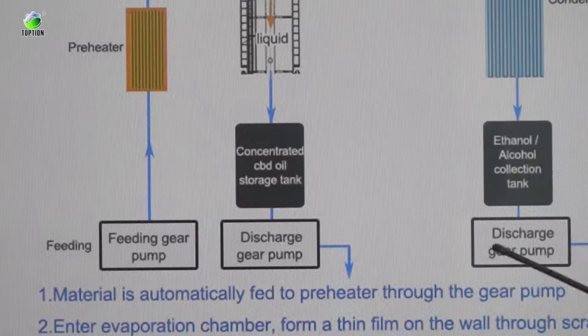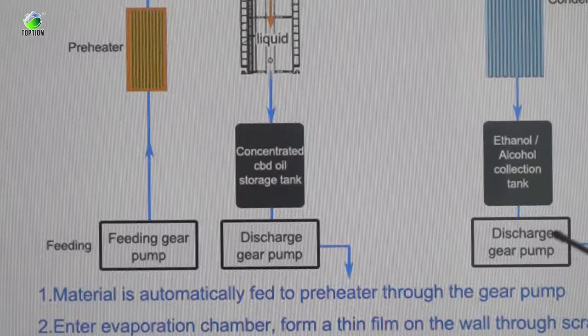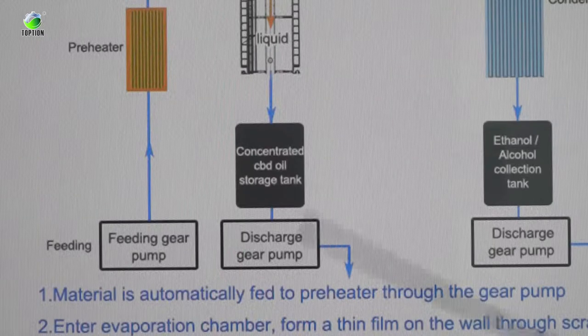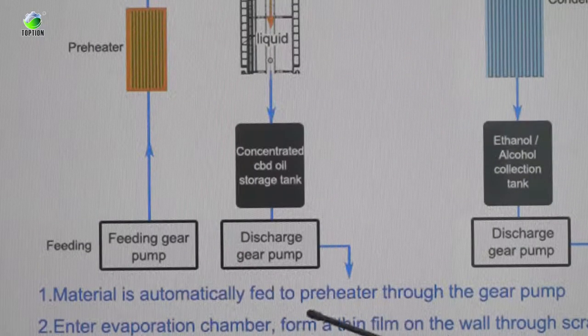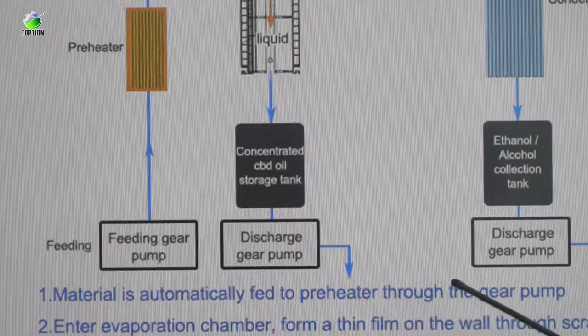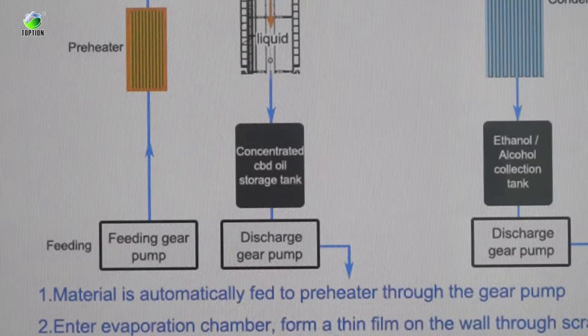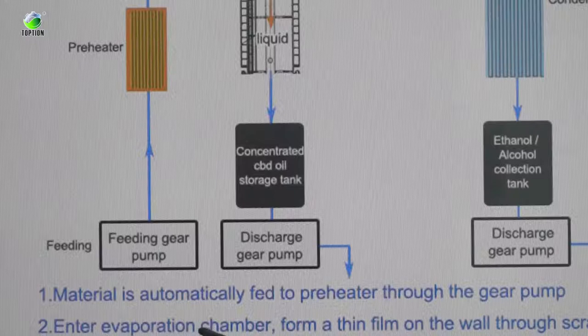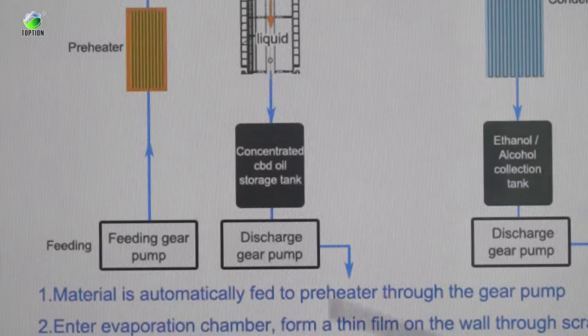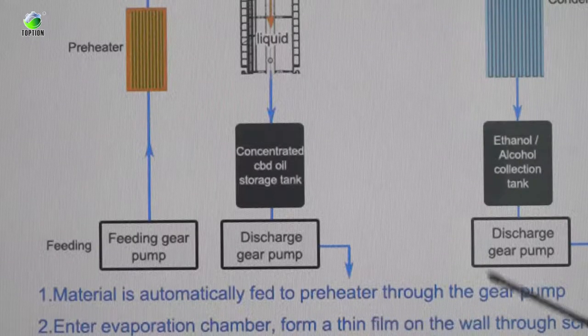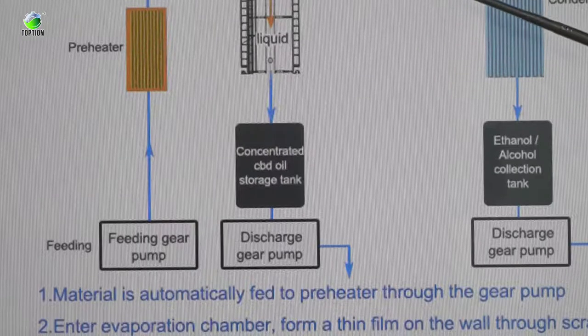And after opening the discharge gear pumps, the solvent can be collected here. From these structures, we can see the material can be automatically fed to preheater through the gear pump, and enter evaporation chamber here to form a thin film on the wall through the scraper here.